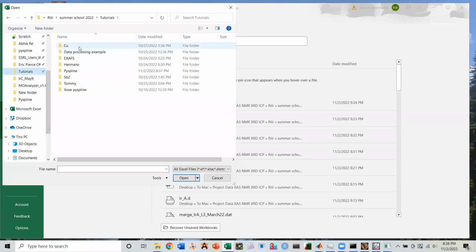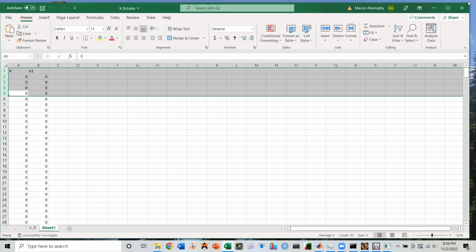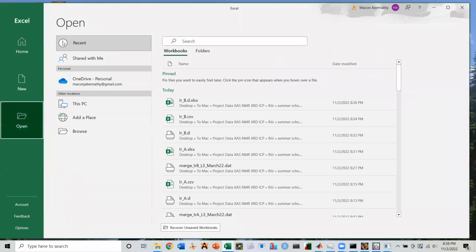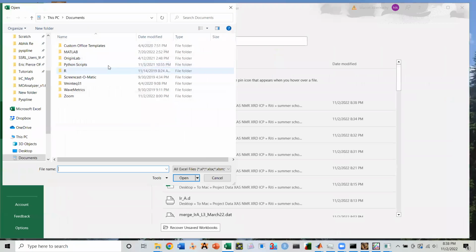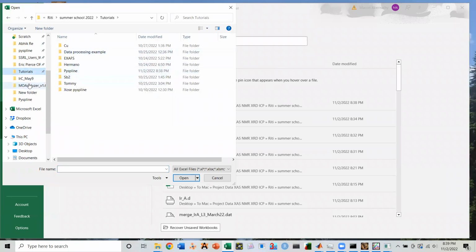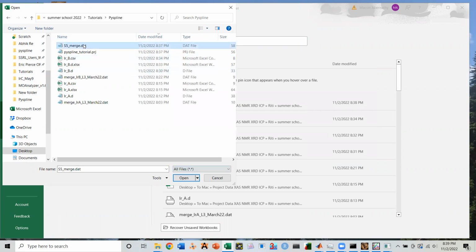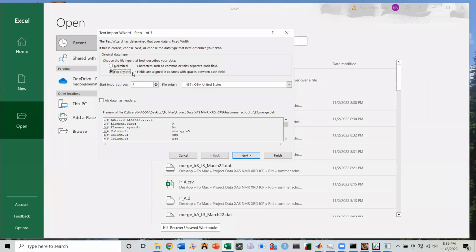It'll be the same protocol, just about. It's the wrong thing. Sorry. There we go. Browse. Let me just pick it out really quickly here.